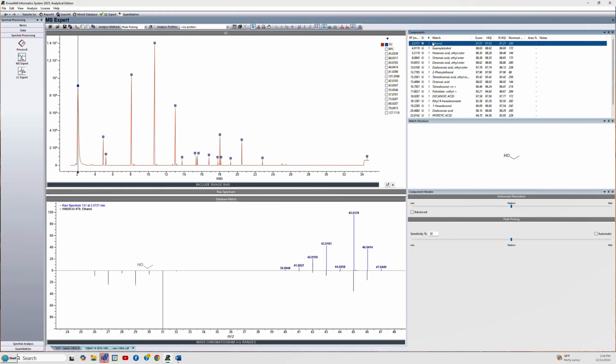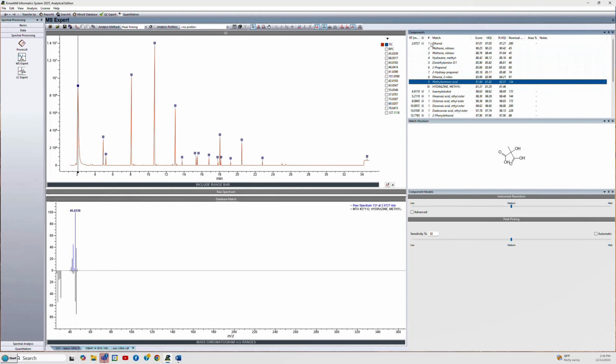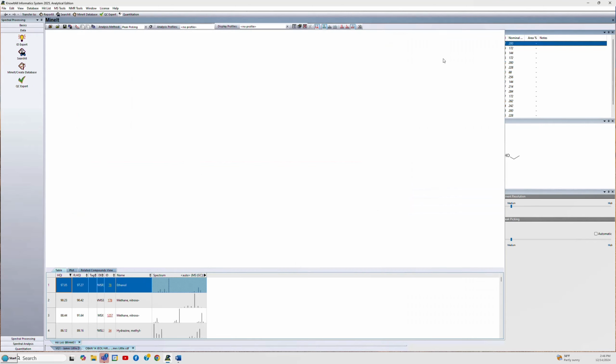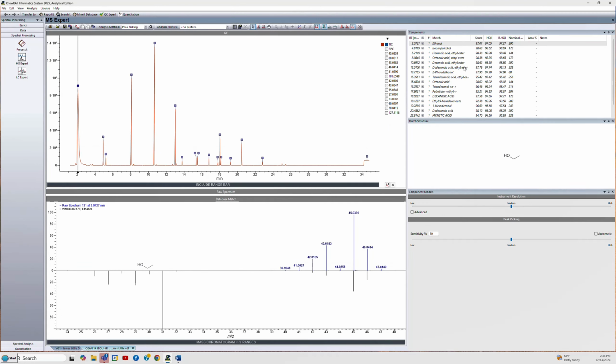And remember, if you step through them, you can always use the right arrow to open up and show the 10 best hits if you want to. If you decide you don't want to see those, just go up to the top and hit the left arrow again. You can send them to a list and mine it if you want to see it in a different display, if you like this display better for looking at the results. To go back to the other display, hit previous application. We're back to the other display.